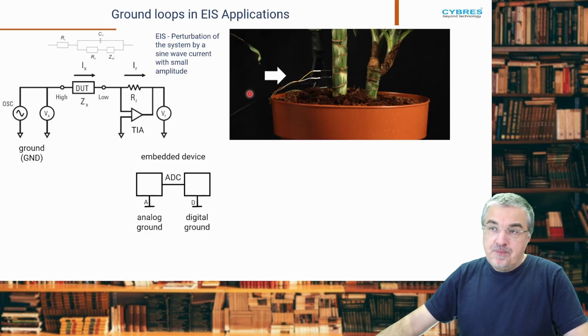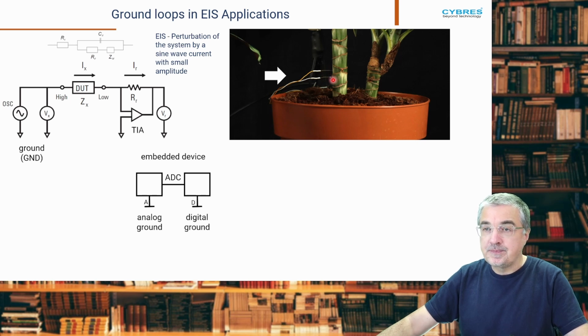Well, to remind a little bit some basics of impedance sensing, how do we do this? We create two potentials, high potential and low potential. In plant research, they are inserted in the system by electrodes, also small silver electrodes. And this differential potential creates current, and we are sensing current through this organic tissue.